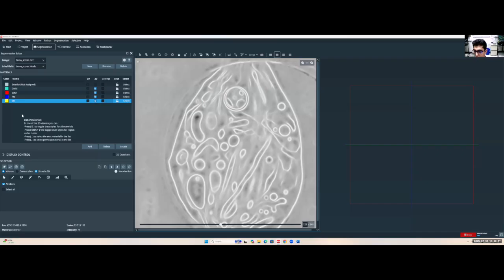Now I have the mitochondria, plasma membrane, and microtubules, and I can start to move into some of the more niche membrane-bound organelles and their vesicular bodies. So I'll create my ER class and my ER vesicle class. These are for vesicles contained inside ER bodies. I want to distinguish those from just freestanding vesicles.